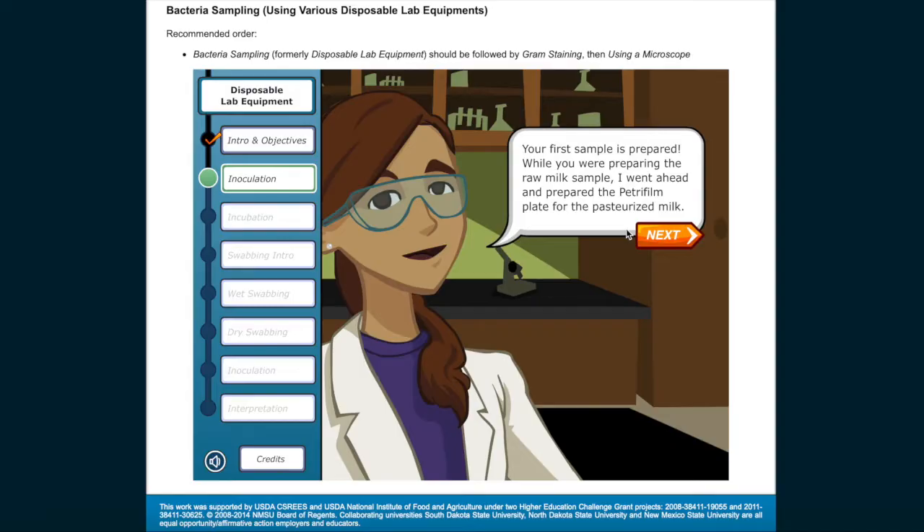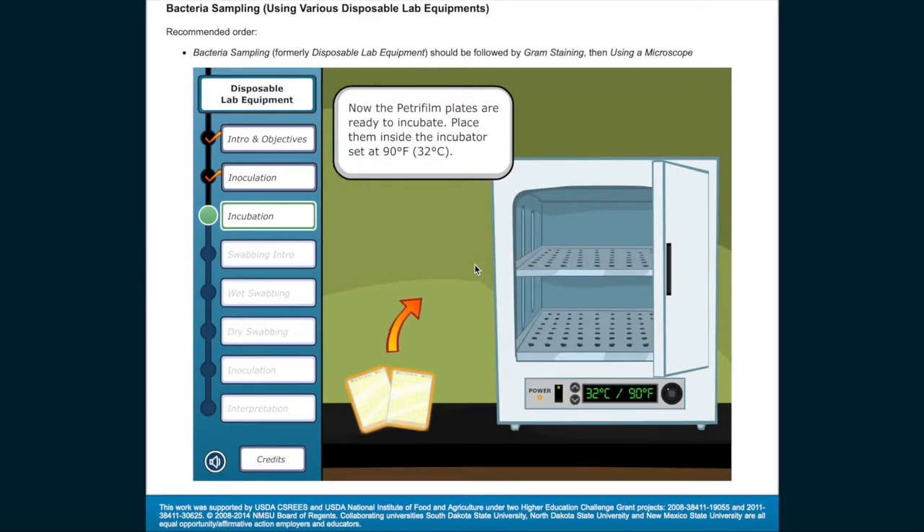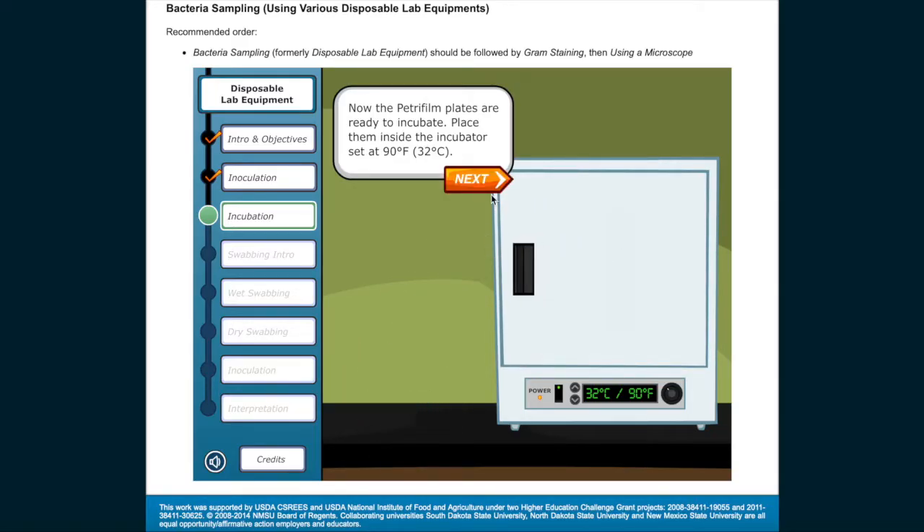While you were preparing the raw milk sample, the Petri film plate for the pasteurized milk has also been prepared. Now the Petri film plates are ready to incubate. Place them inside the incubator set at 90 degrees Fahrenheit, 32 degrees Celsius. The incubator will keep the environment at the perfect temperature for growing most types of bacteria.